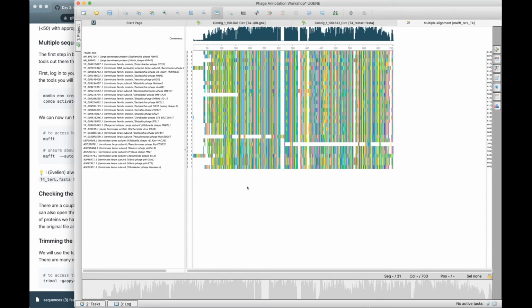You can see that there are potentially some issues with this genome, this gene, and this gene potentially being partial. So one of the decisions you could make is to just leave it out. Or you can leave it in and see, it will probably show you as an outlier on the tree.